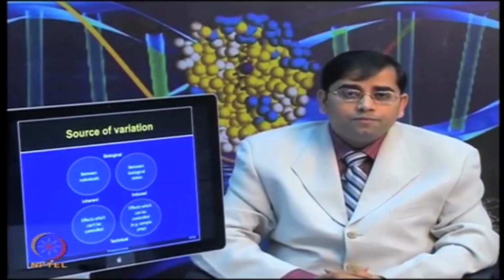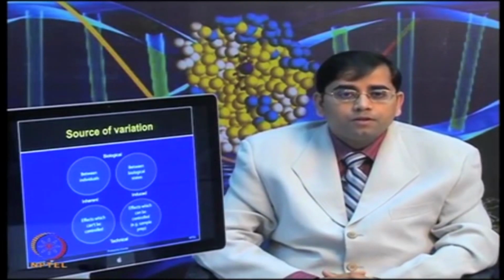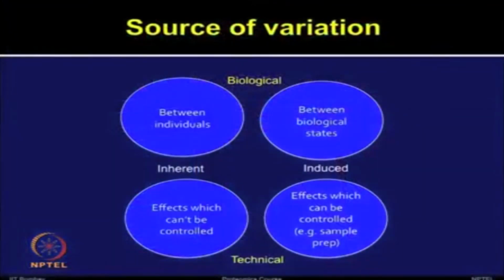So, different sorts of variations can be introduced from biological as well as technical means. There are different biological variations over which there is no control. If you are doing clinical studies, then even if you have done proper age and gender matching, there will still be some variations due to each individual's uniqueness. Those biological variations are very tough to eliminate, but there are a lot of technical variations which can be improved during sample preparation, during the IEF settings, and during equilibration steps.